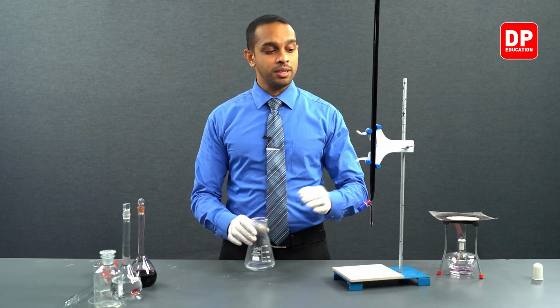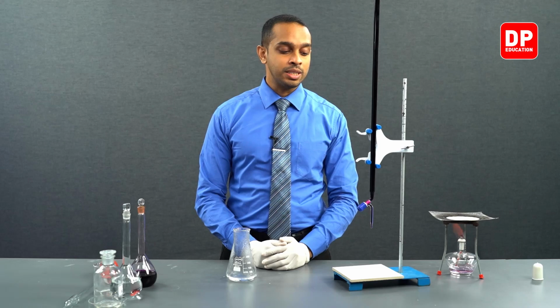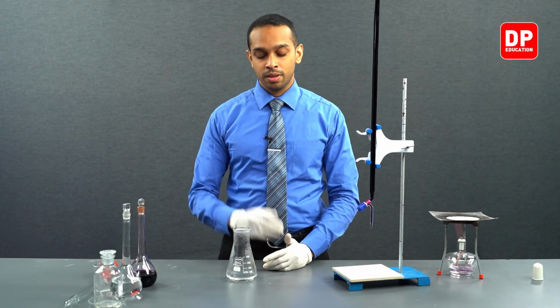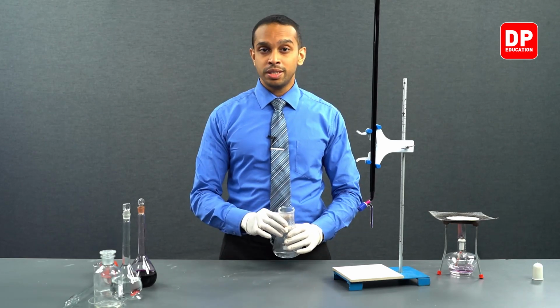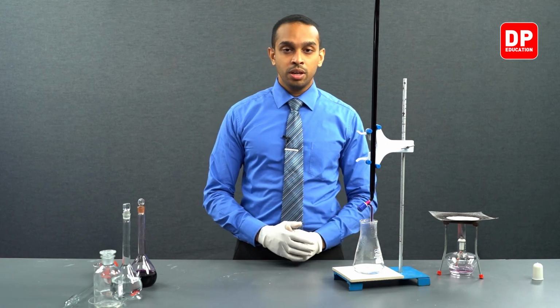And apart from that, we have refilled our burette with our potassium permanganate solution that is going to be used for the titration. So with all of this in place now, we can start our third titration.